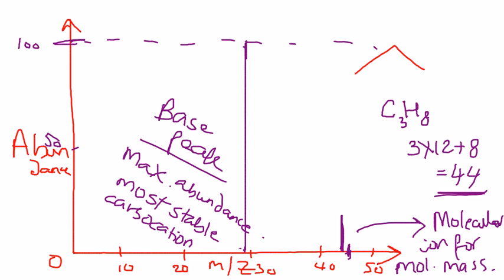Sometimes it is. On the other hand, the molecular ion peak usually reflects the molecular mass of the material. Now one might say, well, on the x-axis didn't we have an m by z? But this z usually has a charge of 1. It's kind of difficult to get a cation which is doubly charged. So one can say that the m by z is nothing but m. It's the mass.